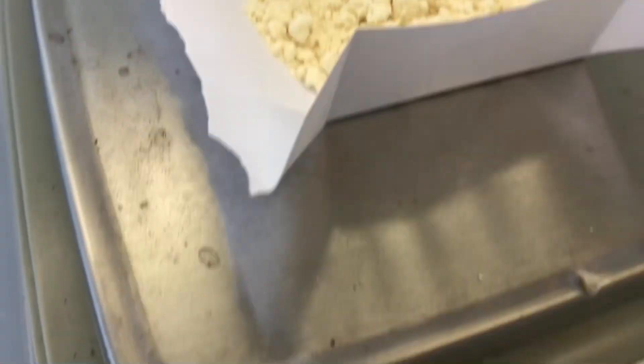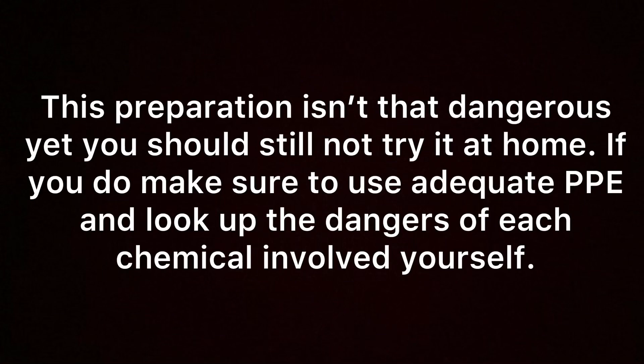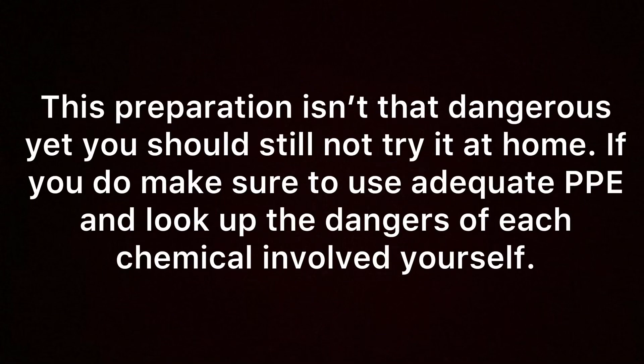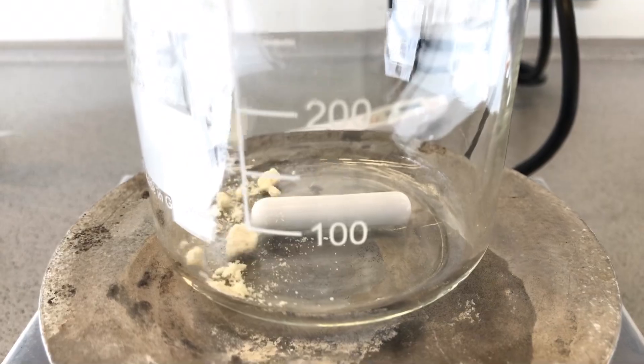The 2-nitrobenzaldehyde was weighed out first, about 9 grams were used. You shouldn't try this at home, but if you do, make sure to look up the dangers of each chemical you use yourself.